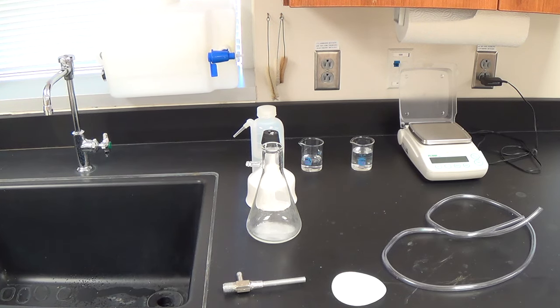The main thing I want to go over in this video is how to set up for the gravimetric analysis, because we're going to use some equipment that you may have never used before, and that's perfectly fine. Here's how you're going to use it.